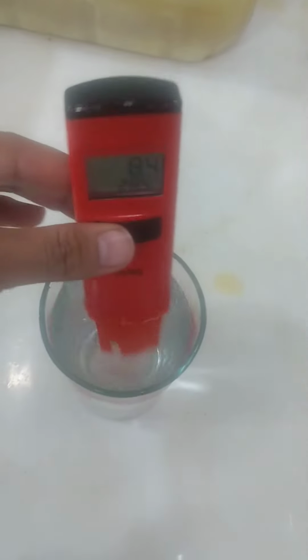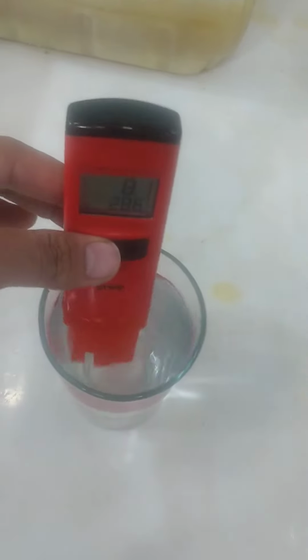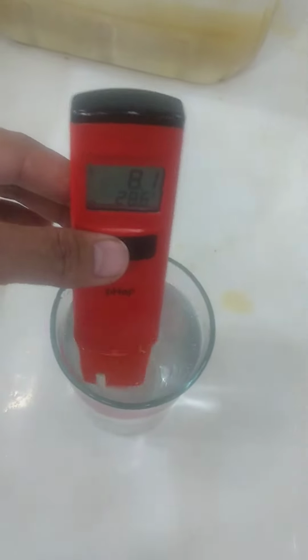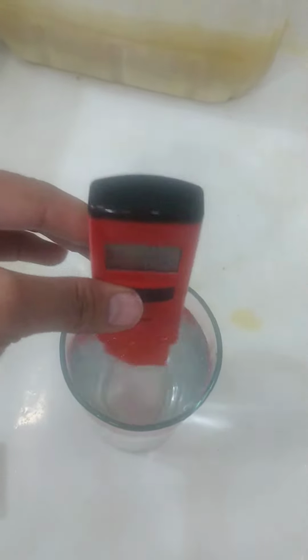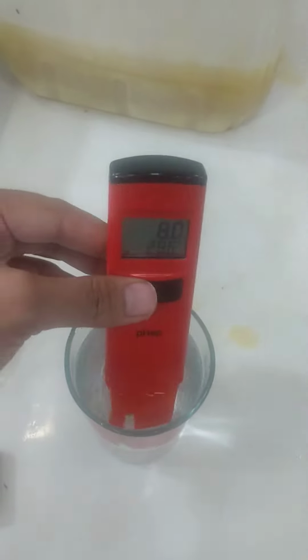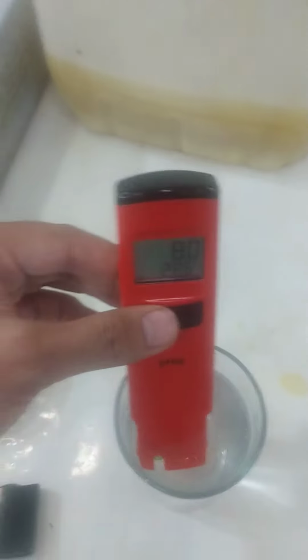Now we use the pH meter and check where it stops. So we check it: 8.1, first 8.2, 8.1, now it has stopped. We hold it 10 seconds or 15 seconds. It shows 8.0, so 10 seconds is done. 8.0, no change, so its final answer is 8.0 pH.